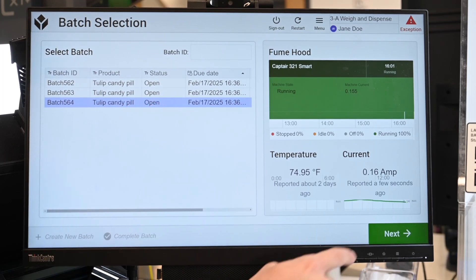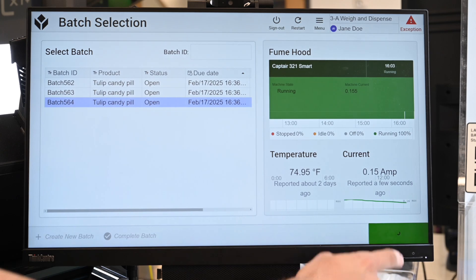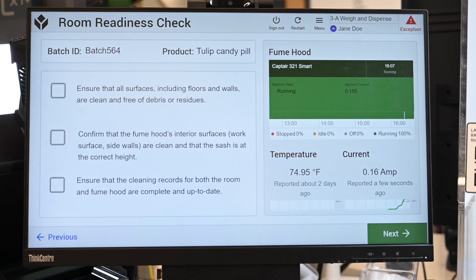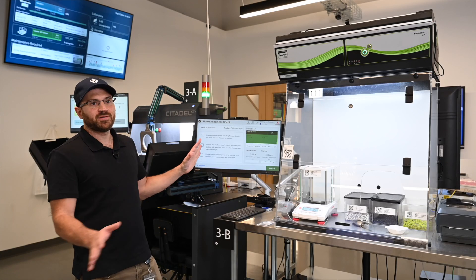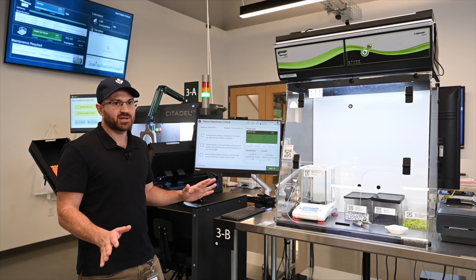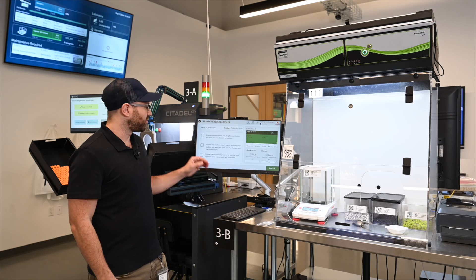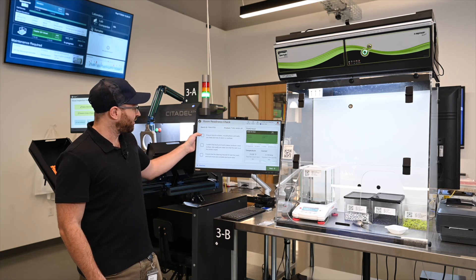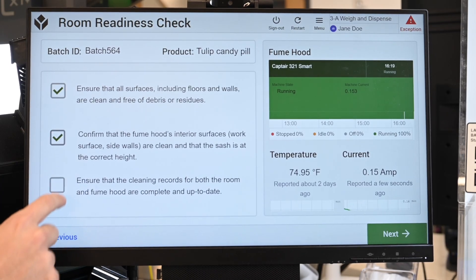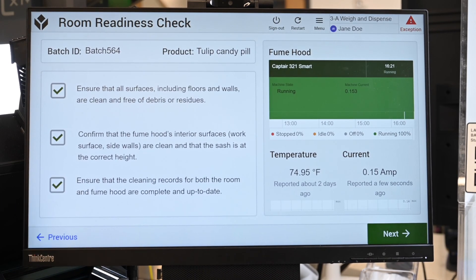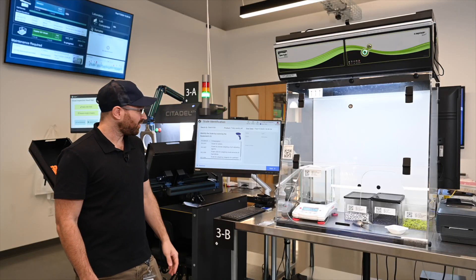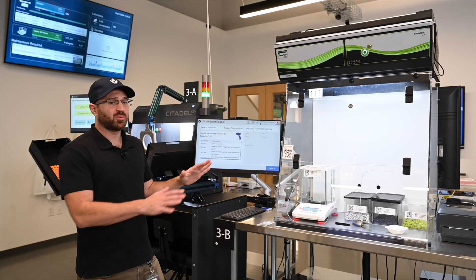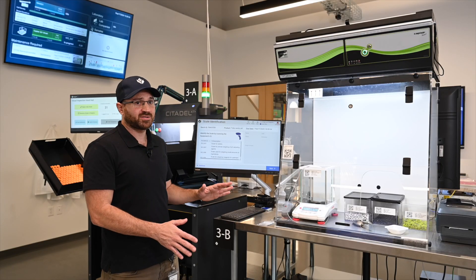As I begin, you'll see I have a number of checks that I have to do before I can proceed to the next station. This is totally configurable in the drag and drop editor within Tulip. Here we have just a few checks that we need to make sure are done, so I'm going to check those off and move forward. All this data is stored with the batch and the history record of the batch.